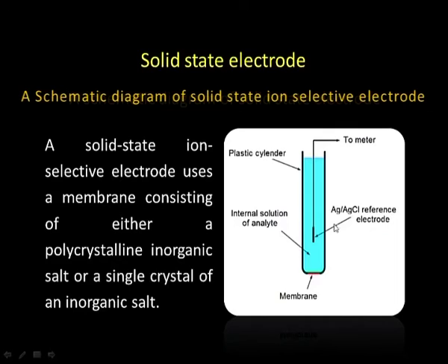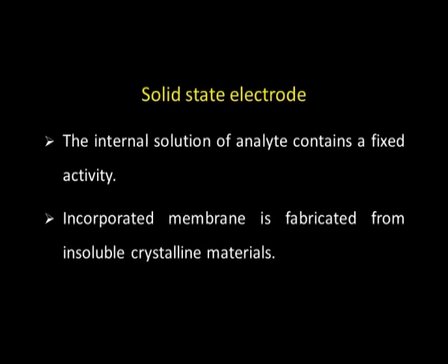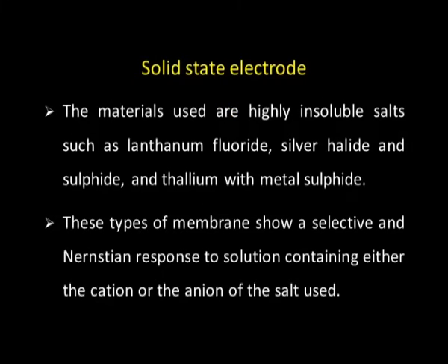A solid state ion selective electrode uses a membrane consisting of either a polycrystalline inorganic salt or a single crystal of an inorganic salt. The internal solution of analyte contains a fixed activity. The incorporated membrane is fabricated from insoluble crystalline materials, and the materials used are highly insoluble salts such as lanthanum fluoride, silver halide and sulphide, and thallium with metal sulphide.